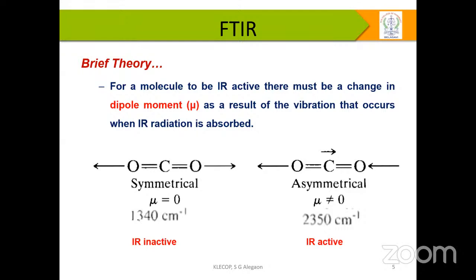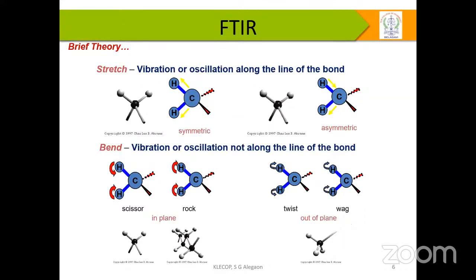So, my dear participants and my dear colleagues, one should understand the dipole moment plays an important role in IR activity. If the substance is IR active, there must be a change in the dipole moment. And everybody knows this. Anyone who wants to understand FTIR should know two things: one is stretching, another one is bending.